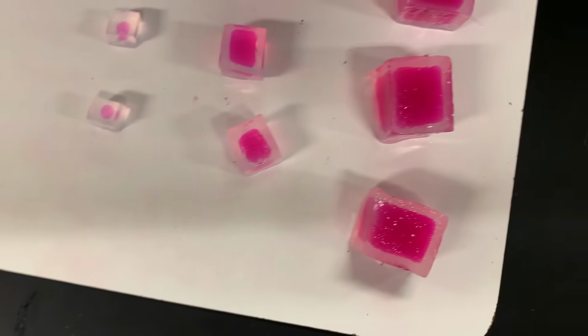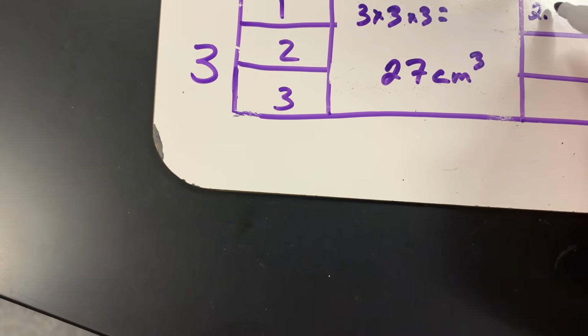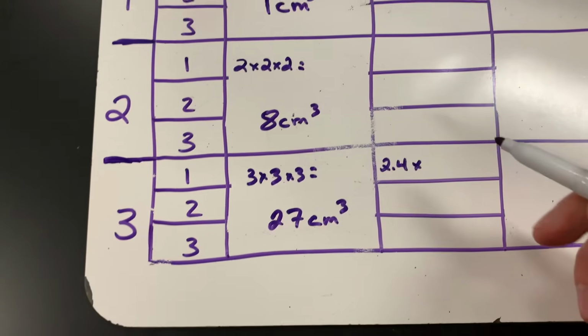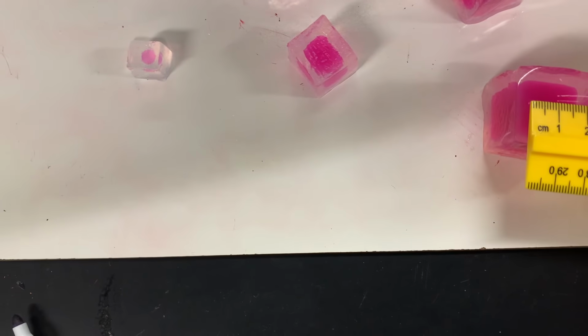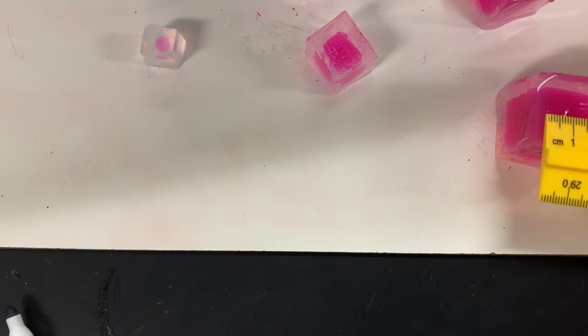Okay, so next thing we're going to do, we're going to come over here. I'm going to start with the 3 one. It doesn't matter which way you go first, guys. I'm going to do just this way first, and I get about 2.4 centimeters. So we'll do this as trial number 1. So we have 2.4 for our 1. Let's go this way next. That's about 2.2. And then our last one, we're going to have to flip it on its side, which I just did. Our last one is pretty much the height, which is about 2.1.